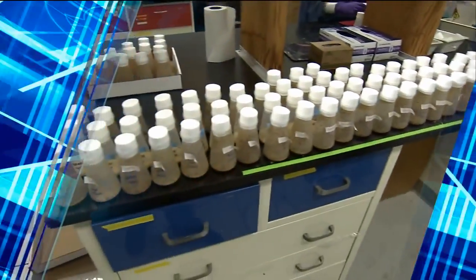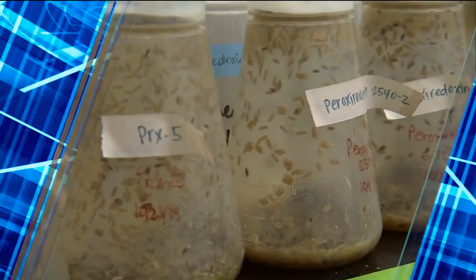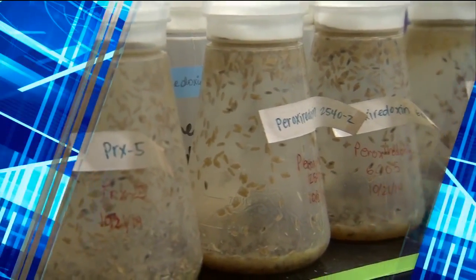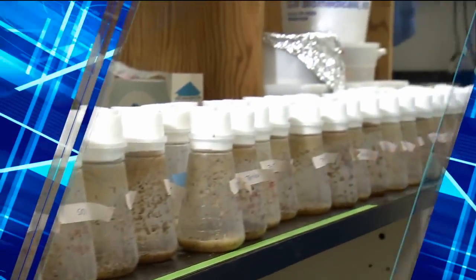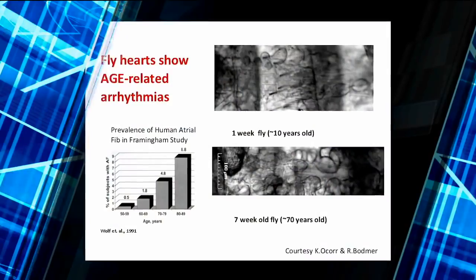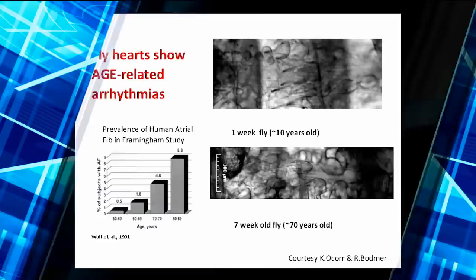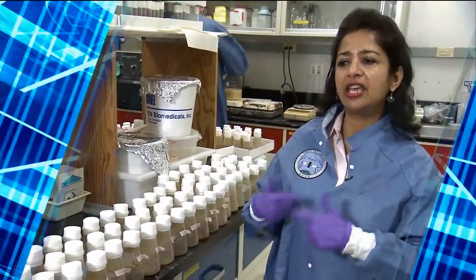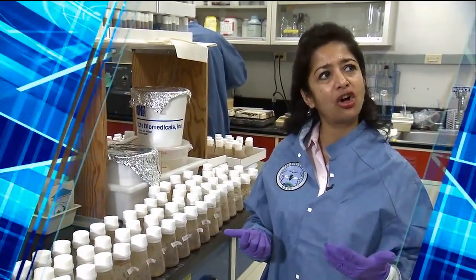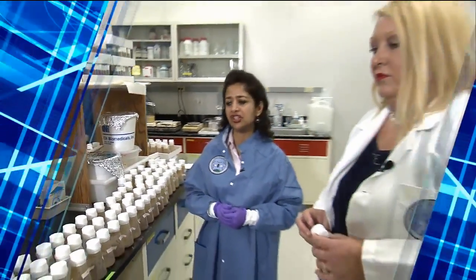And then all these different genetic stocks are used for different kinds of experiments. That's what I was going to say. How do you decide, okay, it's this jar that's going now or this bottle that's going now? It's usually to do with the science question you're asking. So some of them, for example, may be important for studying how the heart functions. And believe it or not, these flies have little hearts exactly like we do that beat and that have the same kind of regulation for the heart rhythm. And so there are some mutants here where the fly heart function is altered, just like it would be in a human in a family which had that particular mutation.